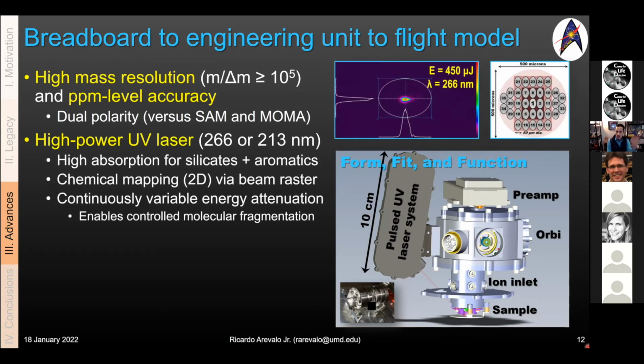And so we're characterizing these laser systems. They're getting integrated with the analyzer, and they bring a lot of science to the table. Something that's kind of cool about our instrument is that it has a little MEMS mirror inside of it. So we can actually scan the laser beam across the sample and derive a 2D chemical image. That's nice. That's really cool.